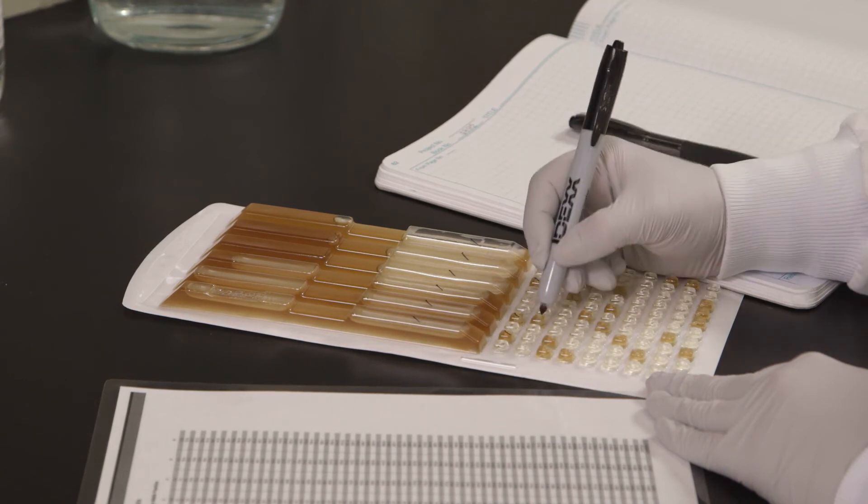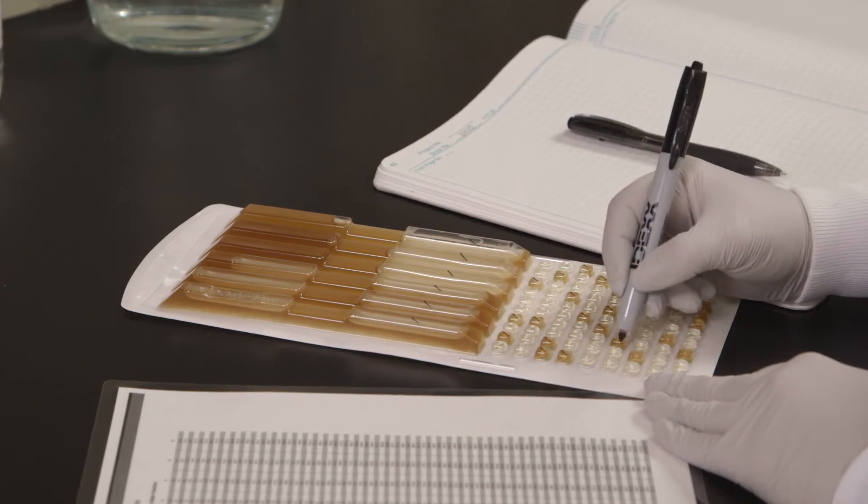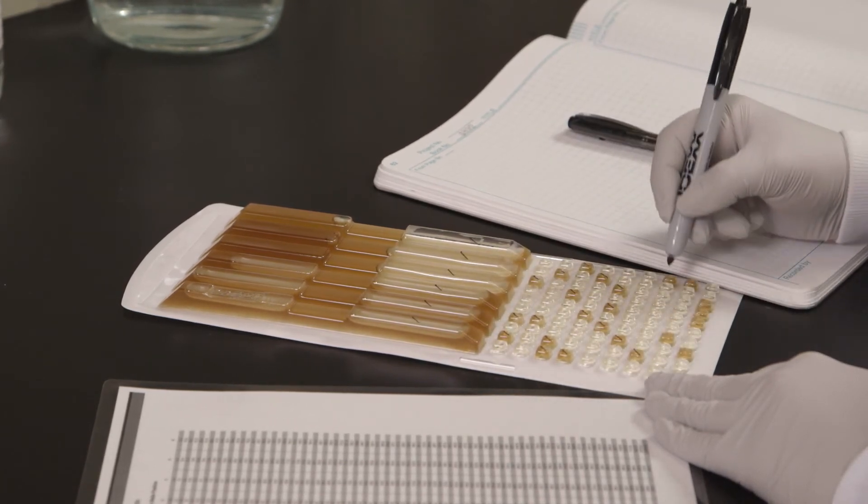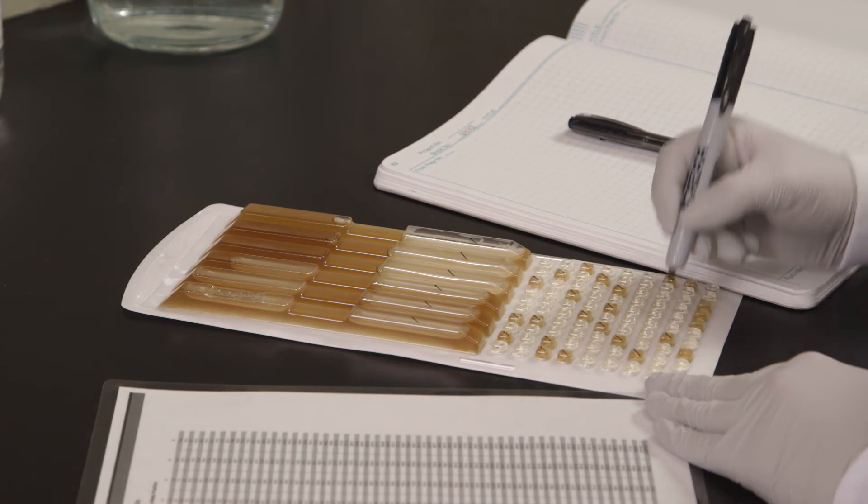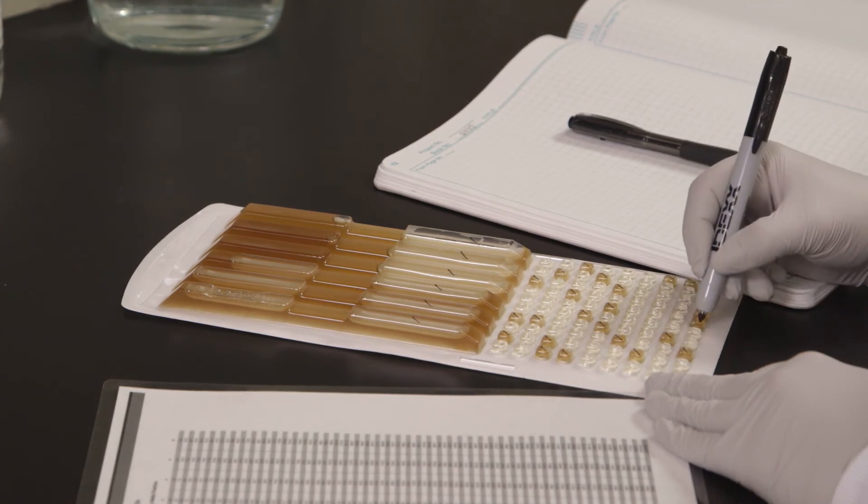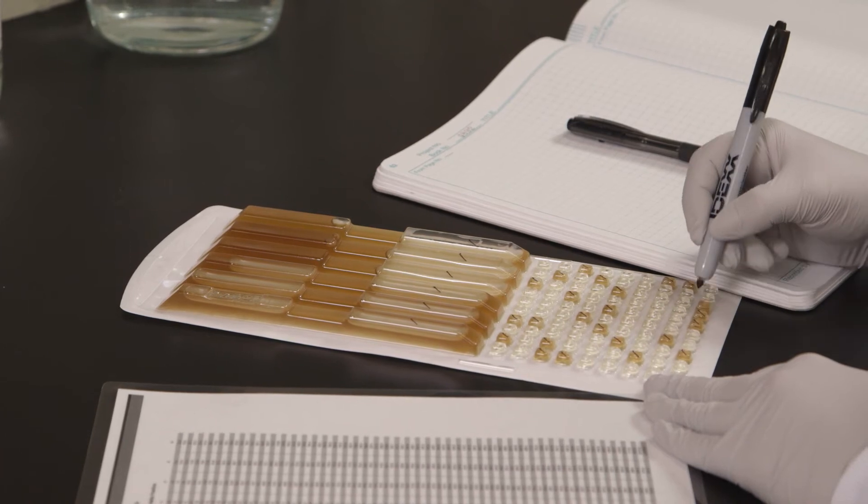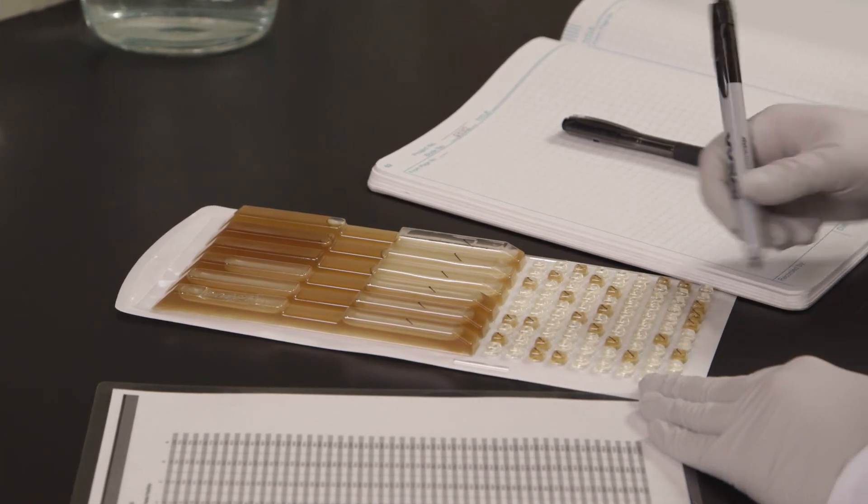Mark each brown or turbid well, count the marked wells, and then refer to the MPN table included with the Quantitray LEG-ALERT trays. Remember to multiply the MPN number by 10 because you are using a diluted sample.